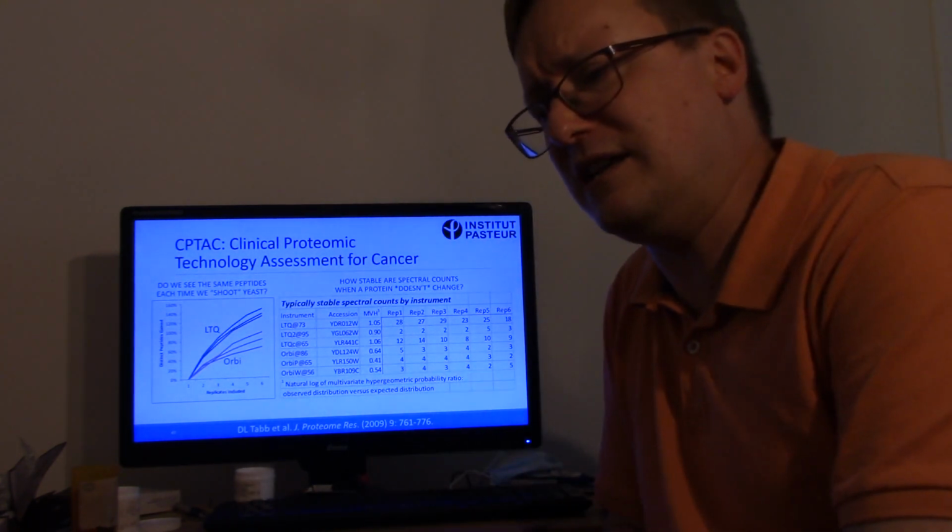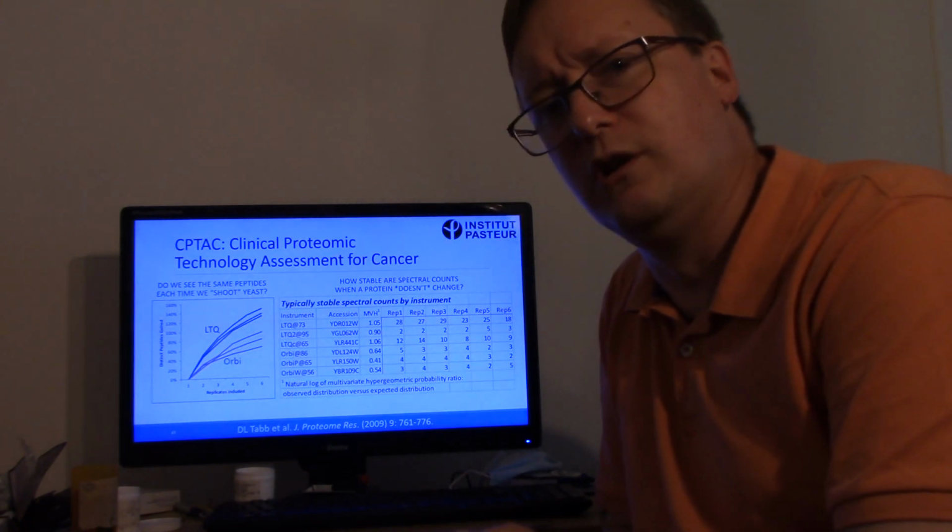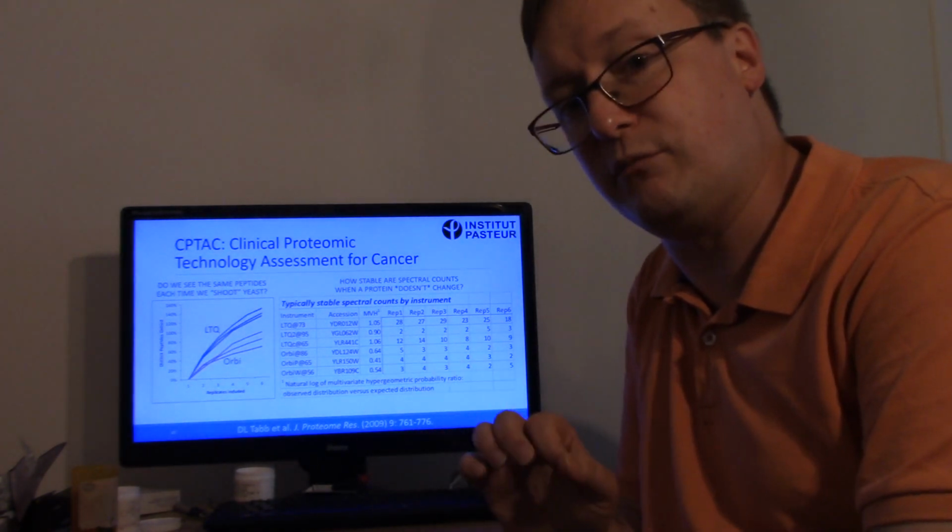What do we expect as a typical amount of variation in the number of spectra we observe for a given protein?